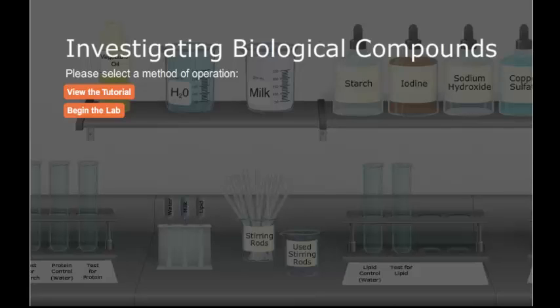So just very briefly, there are four primary types of organic compounds. One of these are carbohydrates. They're also called starches or sugars. These are hydrocarbons. It is mostly just carbon and hydrogen. These provide our bodies with energy. And we'll talk more about these on Wednesday. But today we are going to perform a test for starches.